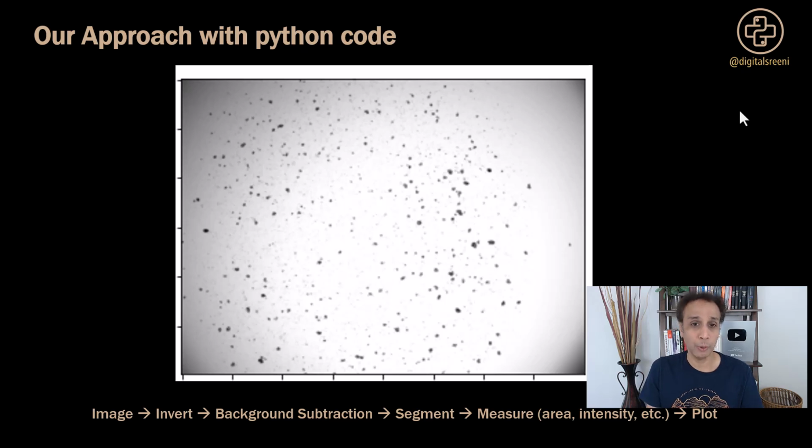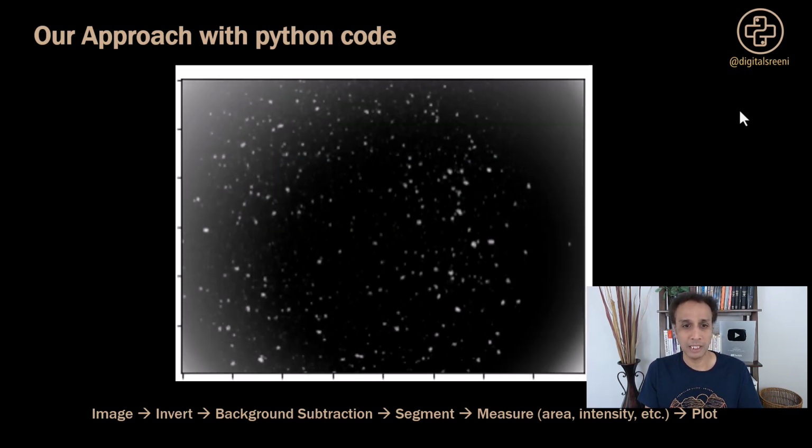So in this case, I'm going to invert the image. So right away, you can see that, okay, against the dark background, white objects. So visually, it's easy for us to see, oh, now I can apply a threshold or something to segment them, but threshold is not usually appropriate or accurate enough. But more importantly, these are low magnification images, as you can tell, because at the four corners right there, you can see how these areas are brighter. Not good if you want to segment these objects.